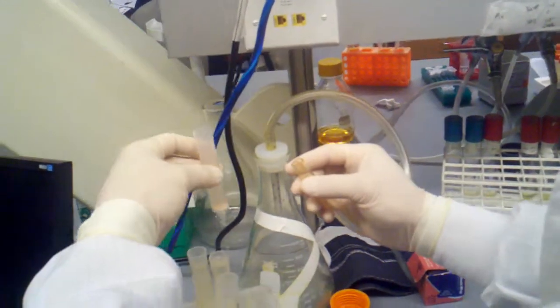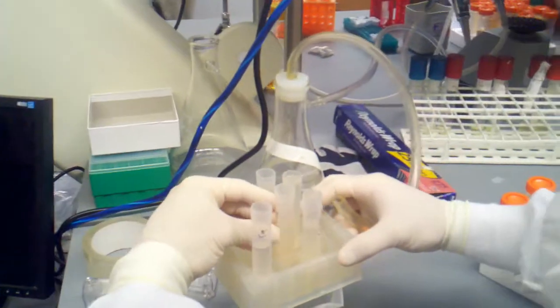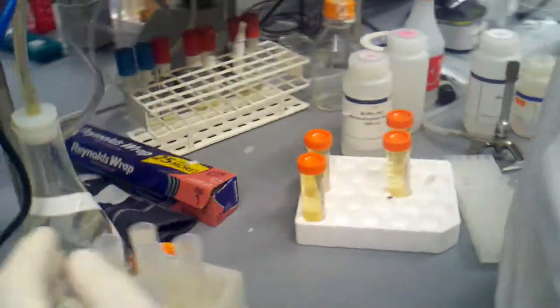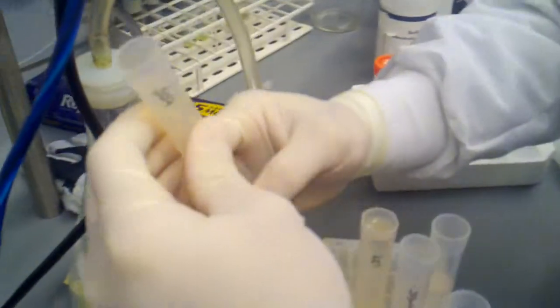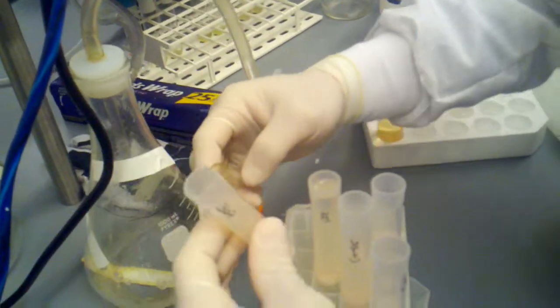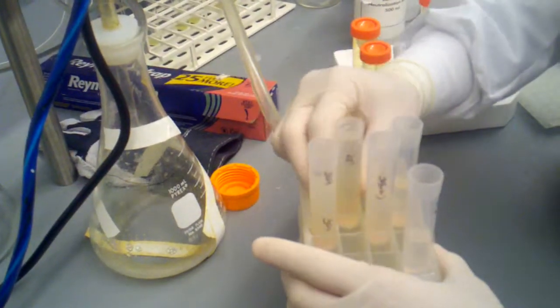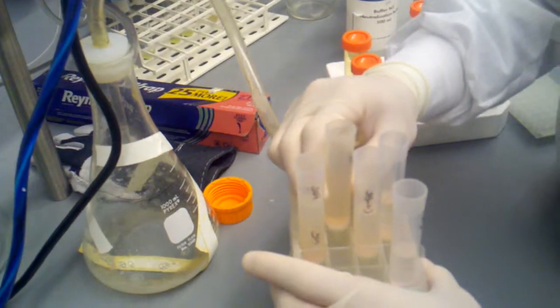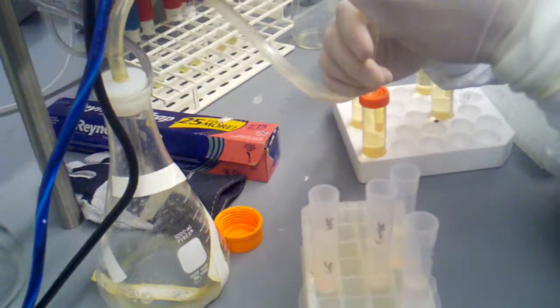There we go. I'm dripping a little bit all over the place, and you can see that I'm getting some liquid in there, so I can just drain that. And the samples that I've started running so far are really moving. There we go. And then our last one. Once this gets started with the vacuum, we don't need to do anything else. It'll run for the rest of the time.